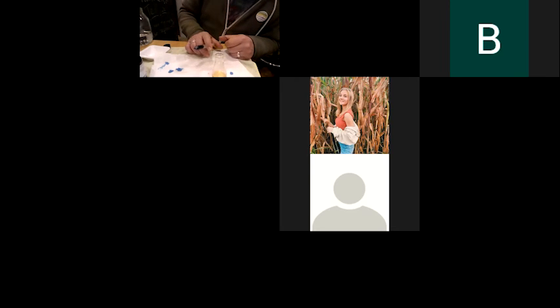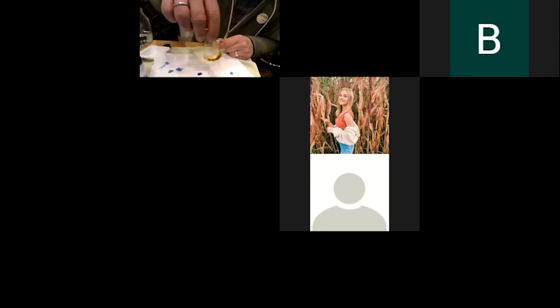Yeah, so again, I've got this yellow color. Let's see. So make a note of that volume. When you get that persistent yellow color, make a note of that volume. Because to be honest, I'm not sure if that's the color we're looking for. Now I'm going to keep adding and see if it gives us that green. Again, just getting a little darker yellow.